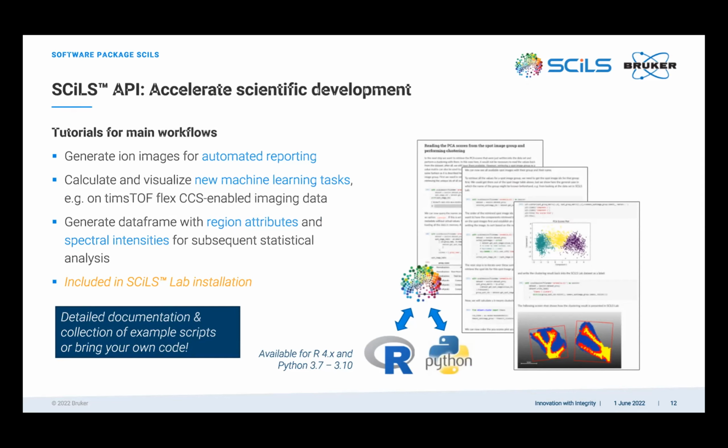The place where we've started to see some examples of this are looking at labeled and ratio-based experiments. So taking a carbon-13 labeled glucose and looking at how it's affecting the metabolic cycle and then pulling out downstream where it's connecting in a control versus a disease-based tissue. Hopefully we'll incorporate that into our software, but we have to hear the ideas and the use cases from our users in order to have a more expressive module within the software.